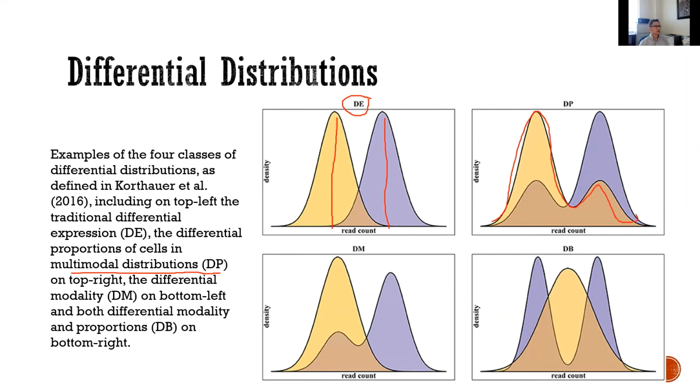In condition 2, the peak changed, but it still is bimodal. And you can also have this differential modality. Then it was a single peak, however, it becomes bimodal. There are 2 peaks, so this is a change with both the mean difference and also the distribution shape change.